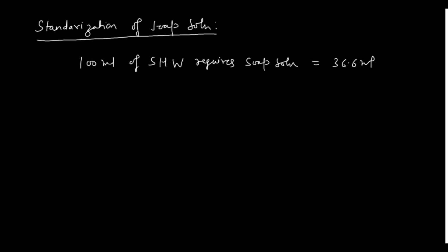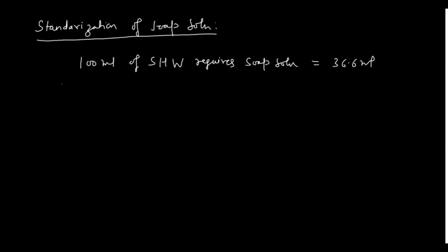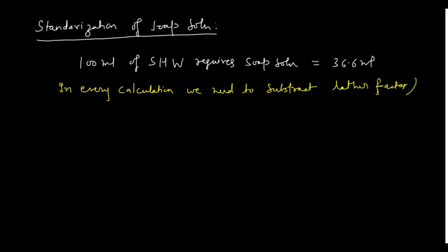36.6 ml. Please check whether it is correct or not. Here, standard hard water requires 36.6 ml. Okay, and now one thing which you should remember always: in every determination or calculation, we need to subtract the lather factor. This is something very, very important which you need to know.